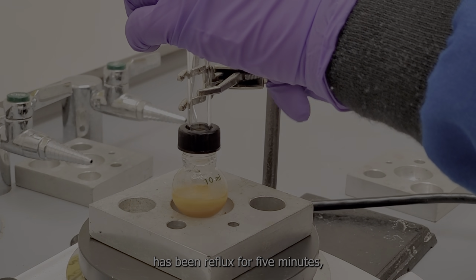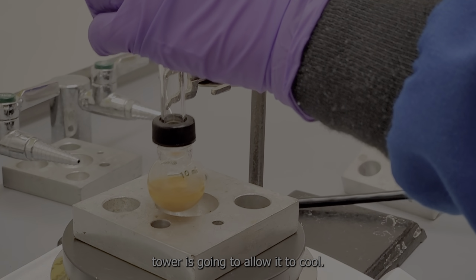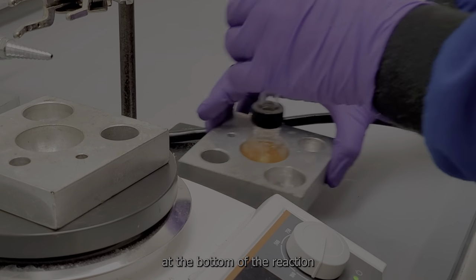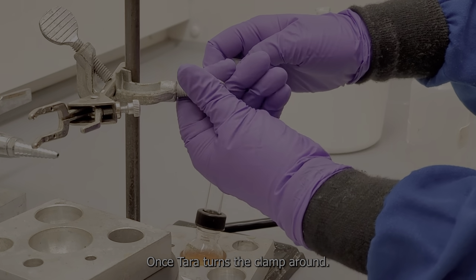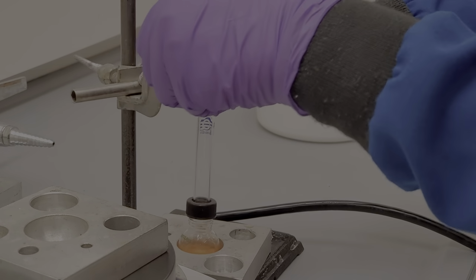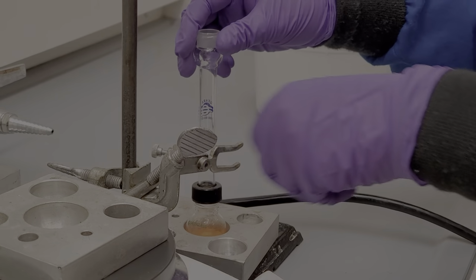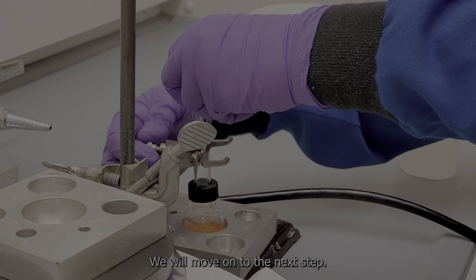Now that the reaction has been refluxed for 5 minutes, Tara is going to allow it to cool. You can notice that once it's off the heat, it immediately starts crystallizing. You can see the solid at the bottom of the reaction flask in a moment once Tara turns the clamp around and attaches it back to the condenser. Once the solution is at room temperature, we will move on to the next step.